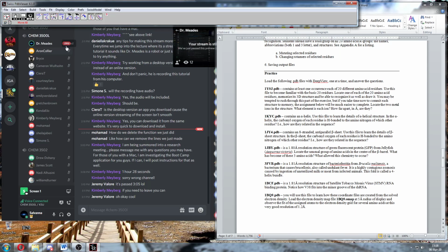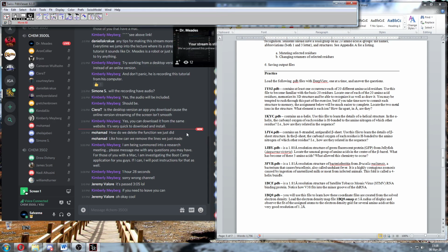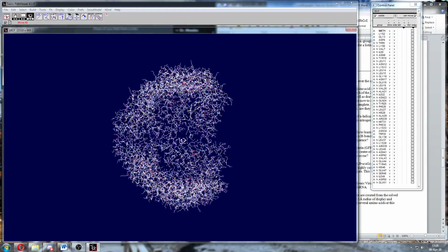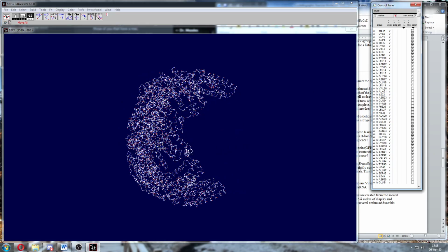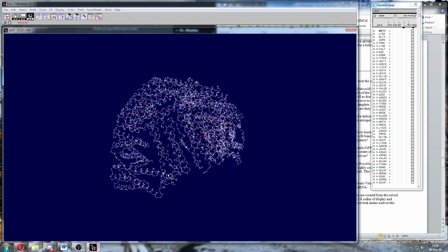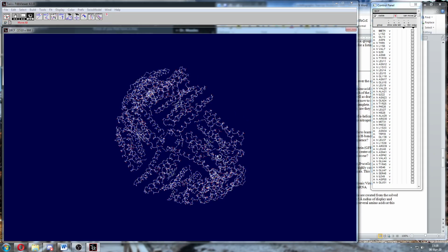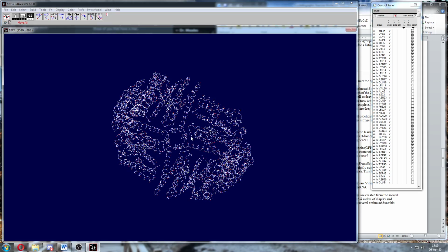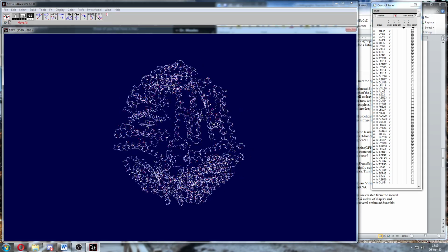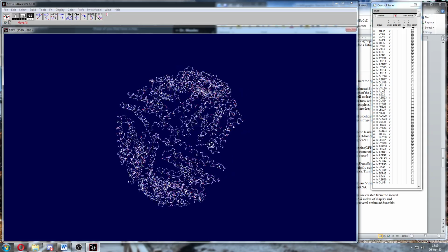We want to open 1BCF. Open 1BCF. And this looks very cluttered. Let's get rid of all the side chains. See what it looks like. So, does this kind of look like half of a baseball? If you take the typical baseball, its 2 outer flaps are sewn together along the seams. So if you imagine another copy of this thing sitting where this one is not sitting, it would form a sphere. So this is kind of one flap of a 2-flap baseball.